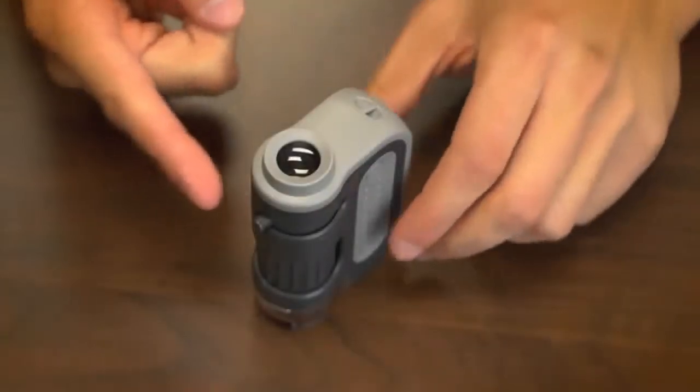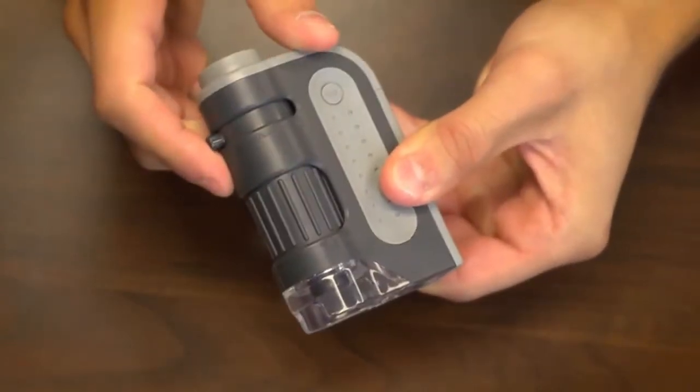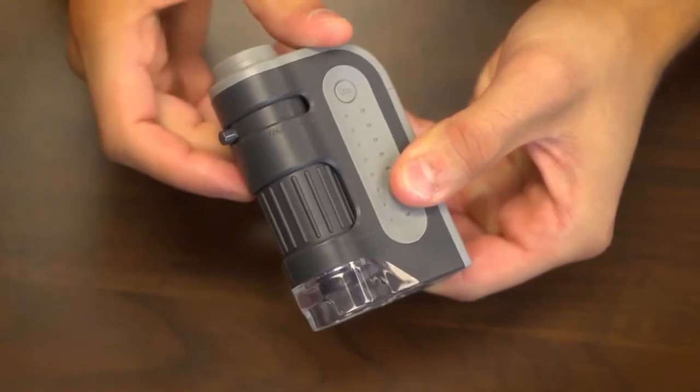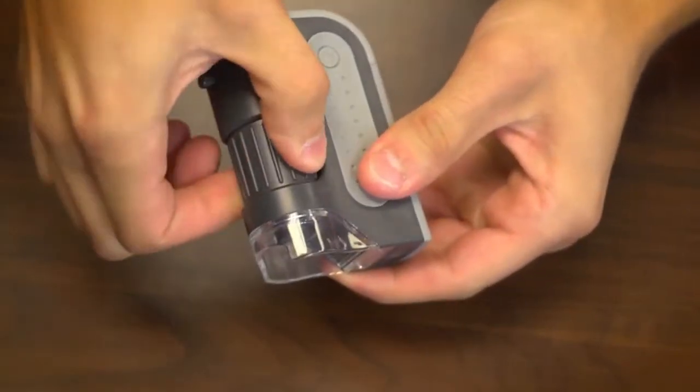You got this little knob here at the top that slides back and forth and is used for changing magnification. Below that we have a nice wide focus adjustment wheel which wraps around the body, is really good to give you that extra control and focusing.